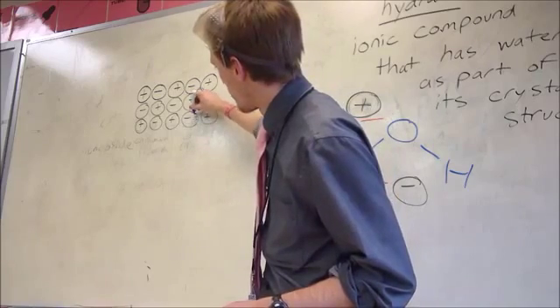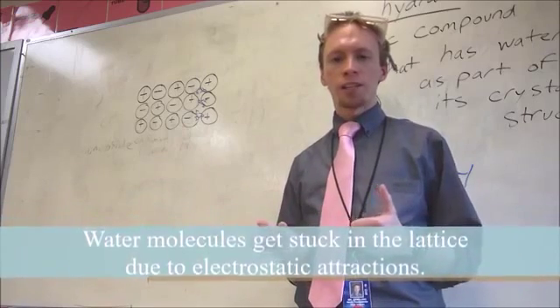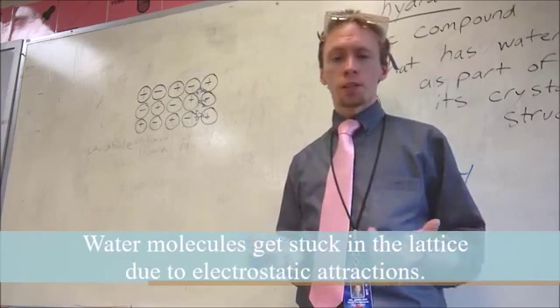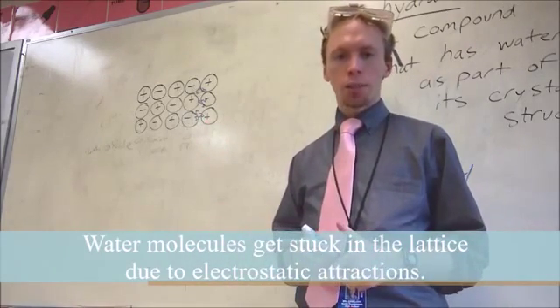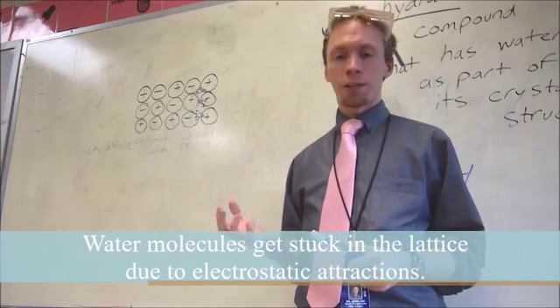And this continues. The attraction between the water molecules and these positive and negative ions is so strong that it's really hard to get the water to come out. Normally, if something's wet, like a sponge, you just leave it out in the air and it'll evaporate. But with this lattice, this hydrate, the water is stuck inside of the lattice. It can't get out very easily.